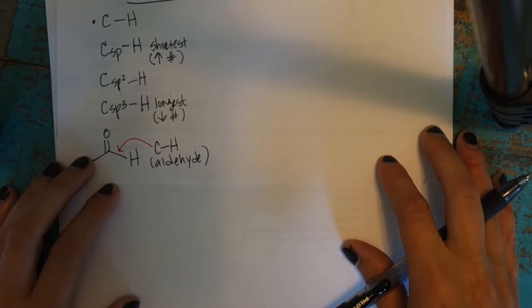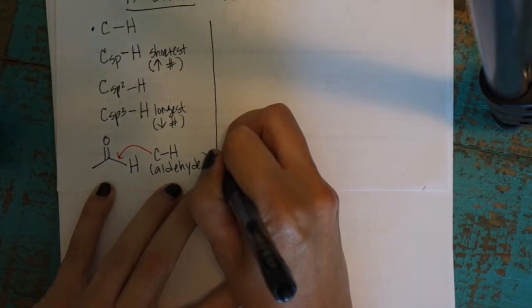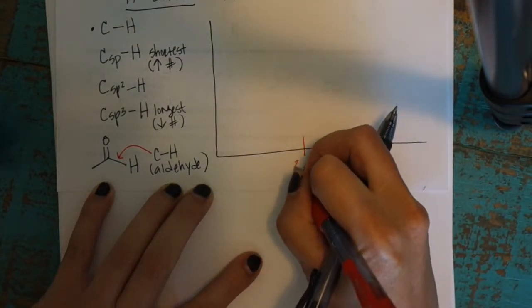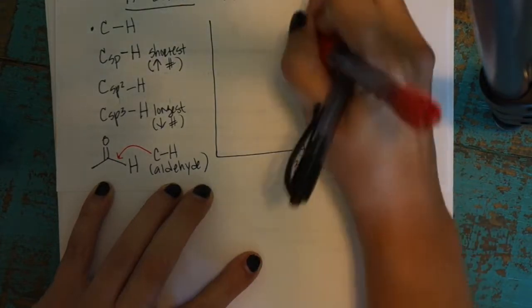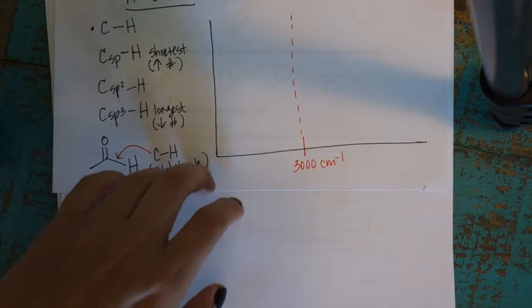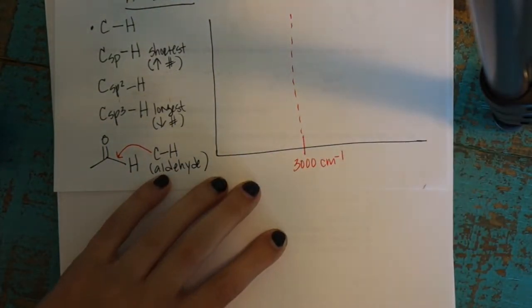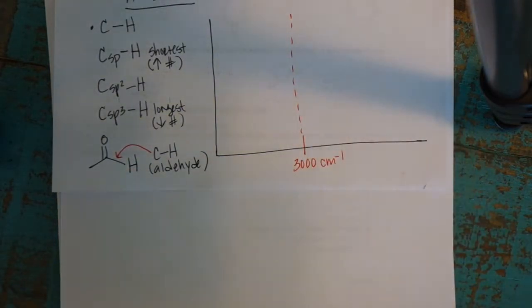And they each have their own distinct look in the spectrum. So just to draw that region, an important marker for the CH bonds is 3000, and I mean exactly at 3000. Oftentimes if you have a hard copy of a spectrum, you might want to take a straight edge like a ruler and actually draw a line down at 3000 and see where the CHs fall.